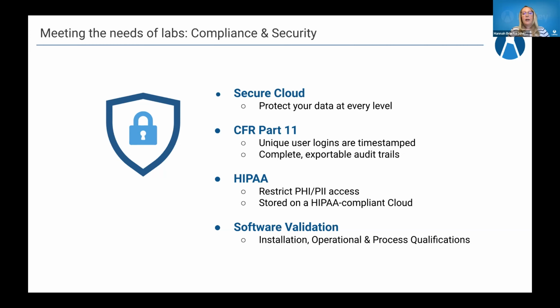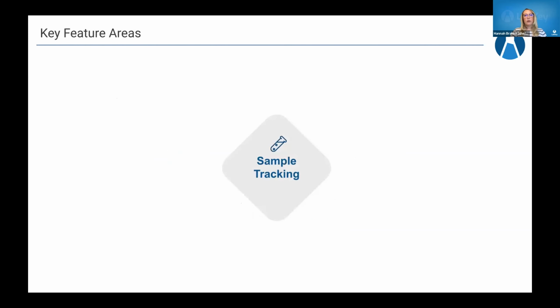And then lastly, the ability to add software validation as needed. So we've run into many groups this year in particular that have wanted this program validated, and we're excited to be able to offer that this year as well.